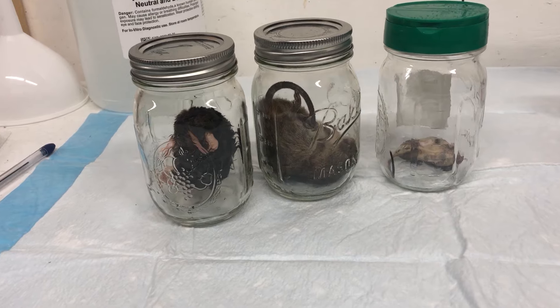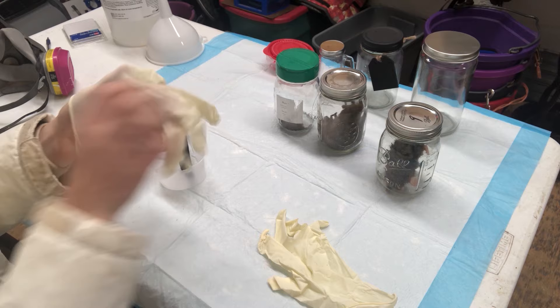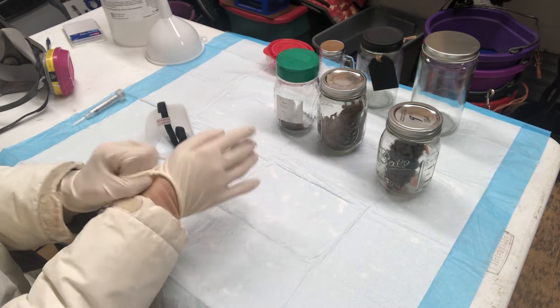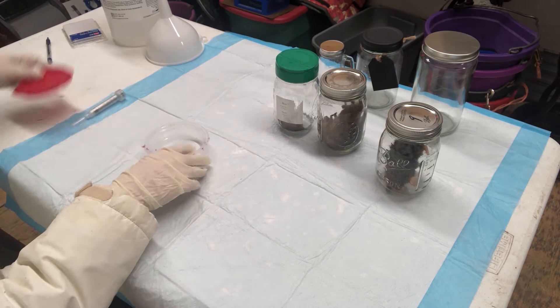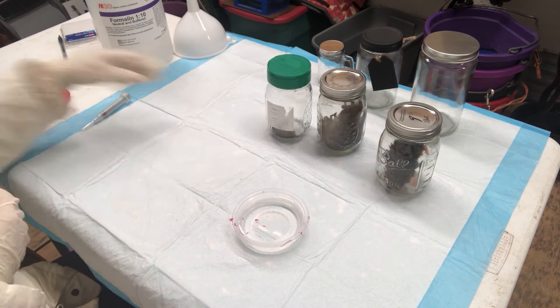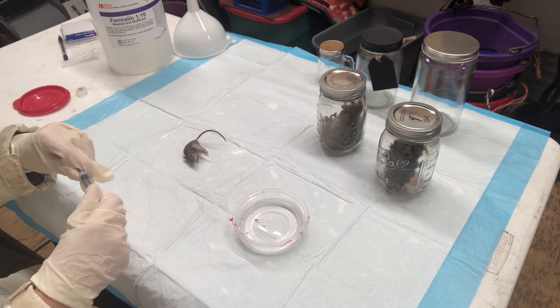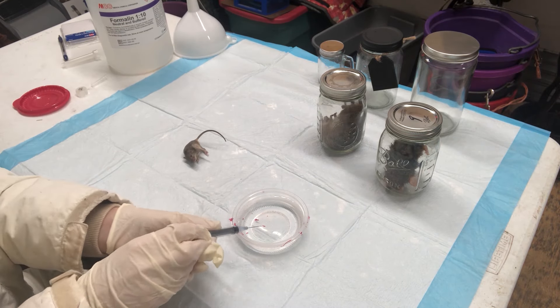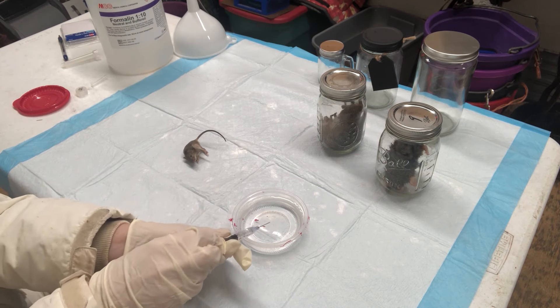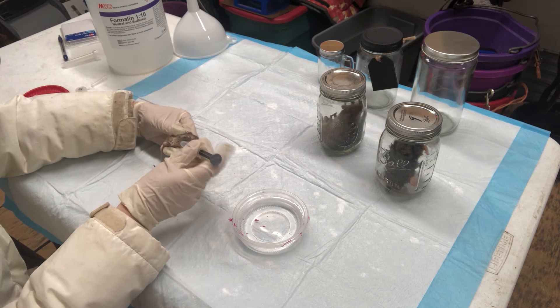Once you have everything and you have either a freshly dead or thawed animal, you are ready to go. Strap on your gloves and put on your respirator. Pull out your little dish and fill it with formalin — it's important that this step uses only clean fresh formalin. Lay out your specimen, pull out your needle and syringe, fill it with formalin, and begin injecting in the major areas, making sure you're not injecting air. It's most important to get lots into the abdomen and gut.